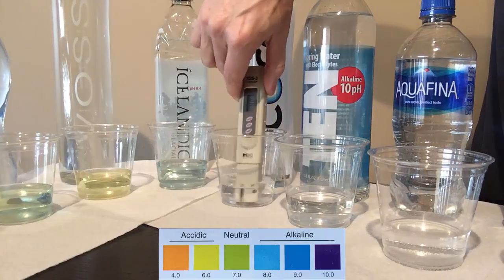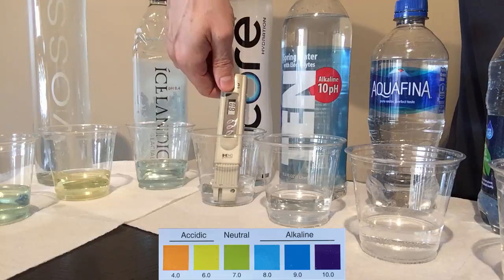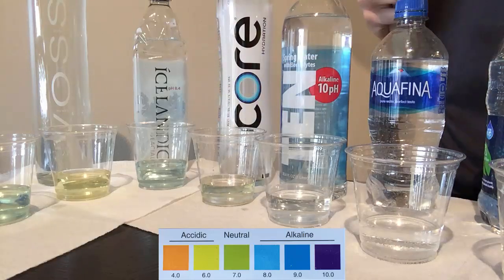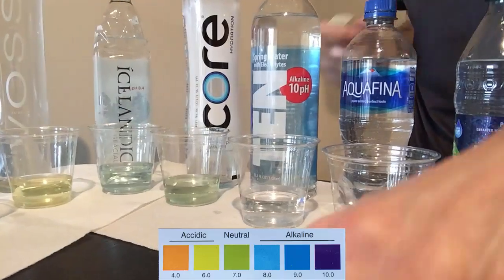CORE Water went through a 7-stage purification process and claims a neutral pH at 7.4. With a TDS at 80 ppm, the pH test shows the water stays somewhat green — just about neutral.